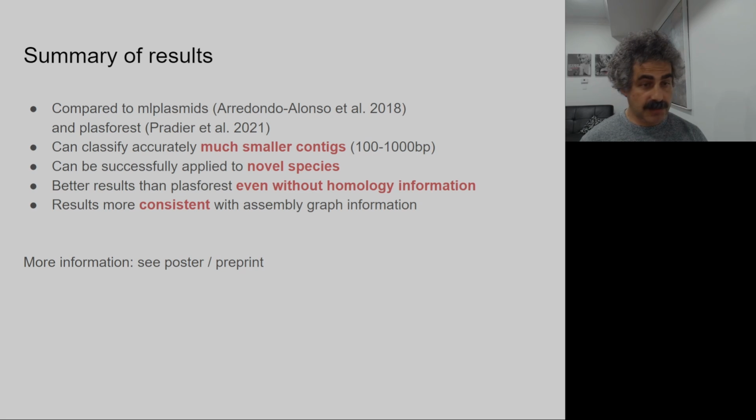Also, our tool can be successfully applied to novel species, so those that we didn't train on. We have better results than plasforest even without using homology information. And finally, our results are more consistent with assembly graph information.